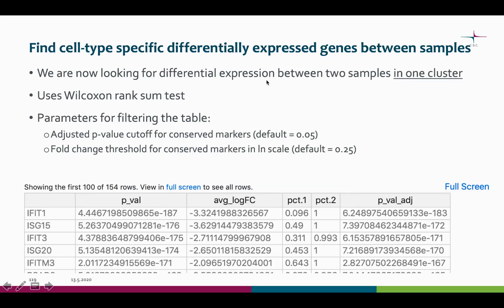The same tool also gives you the differentially expressed genes between the samples in a cluster of your choice. This tool gives results for one cluster at a time, and you can give the cluster number as a parameter. The test here is very similar to the one for conserved markers, and you also get a filtered table as a result. Note that you can further filter the table using a filtering tool in the utilities category.